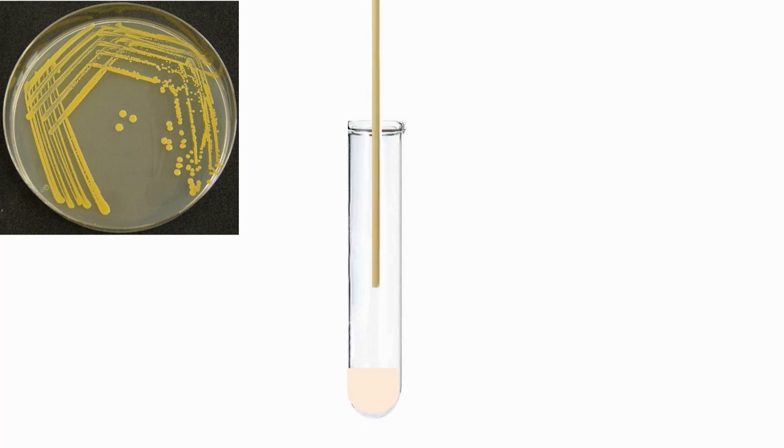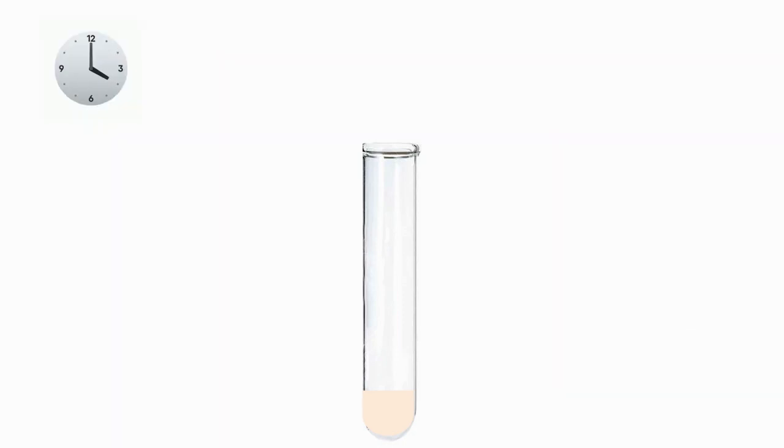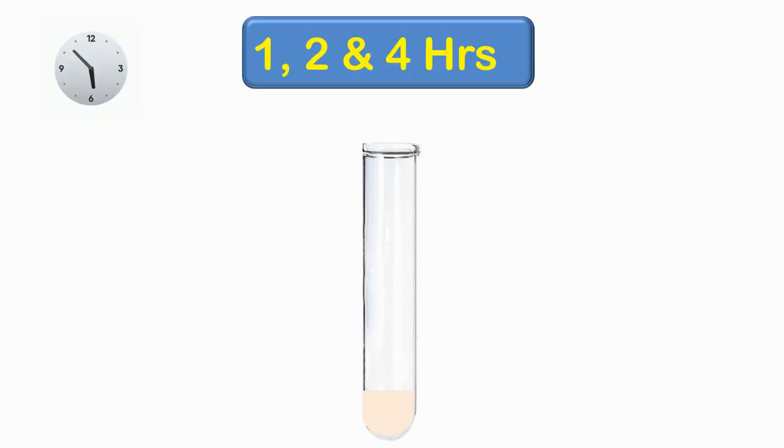It should form a milky suspension. Now incubate the tube at 35 degrees centigrade for 4 hours. Examine after 1, 2 and 4 hours for clot formation. Observe by gently tilting the tube for evidence of clotting.